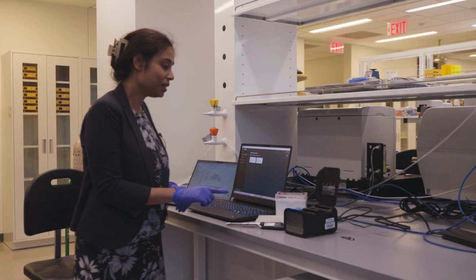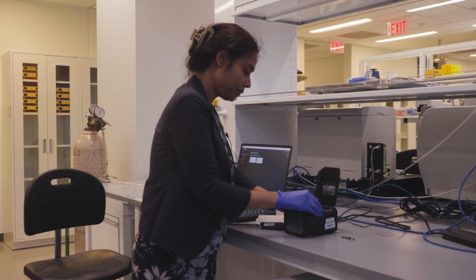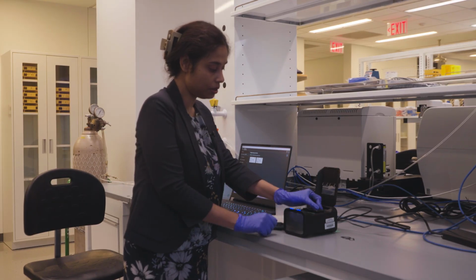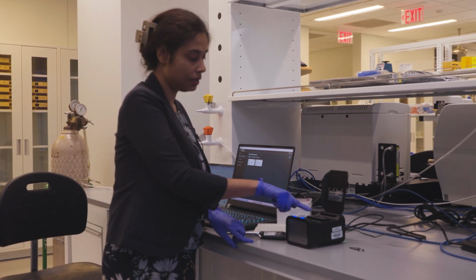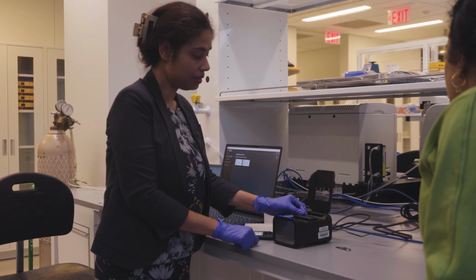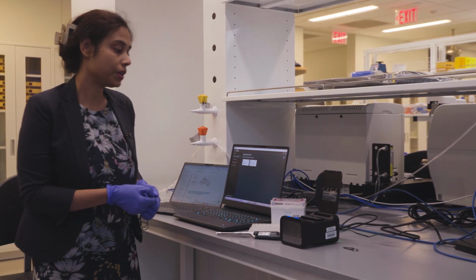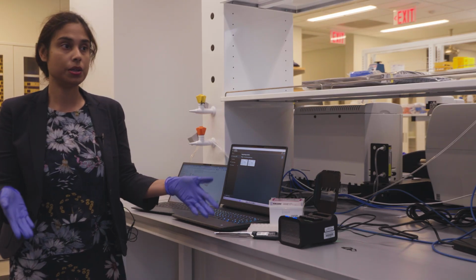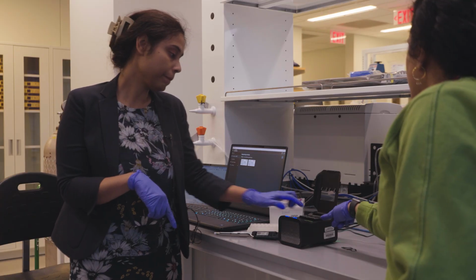Yeah. So let's start here. This cover, you are gonna move clockwise, and then you would be able to see this inlet port, and it already has some kind of storage buffer inside in the reservoir. This inlet port is the port where we are gonna load our samples, but it also has a little bit of air bubble. So this is the inlet one, right? Here, this one.